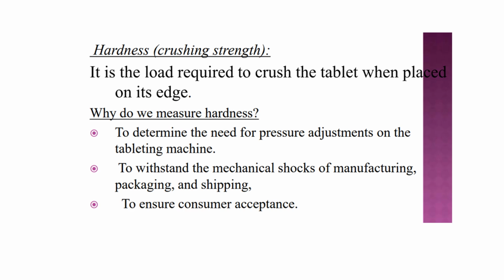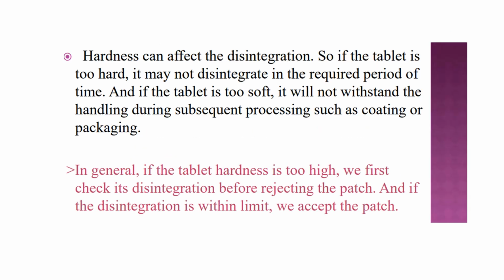And at the time of manufacturing, packaging, and also transportation, if the tablet does not have an acceptable or standard hardness, it will lead to cracking or breaking of the tablet. Then thirdly, consumer acceptance. And not only that, hardness can affect the disintegration. That means if the tablet is too hard, it may take more time to disintegrate.